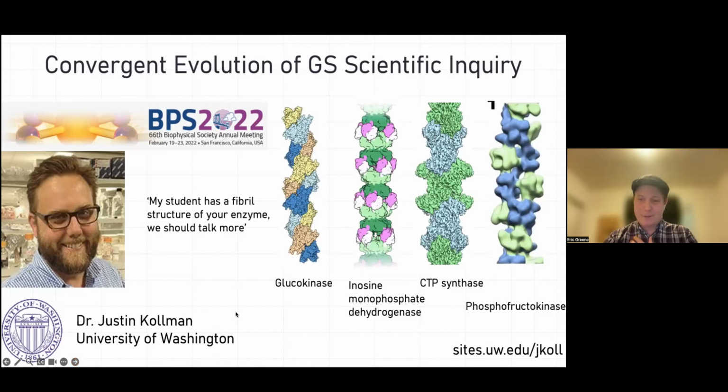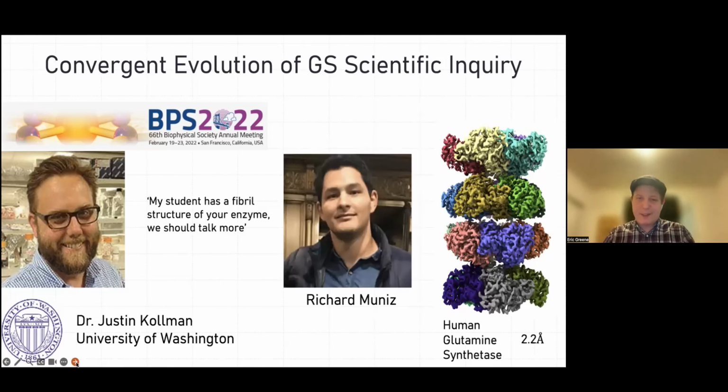The Coleman lab has solved just a ton of different cryo-EM structures of enzymes and is really at the forefront of this field. This is just a small subset of some of their recent studies. But luckily, we wanted to collaborate with each other. And so now I've been working with this very talented grad student, Richard, who provided an apo form glutamine synthetase filament structure, also at about 2 angstroms. And so we've been working with that to look at what some of the conformational differences are upon filamentation and what this is actually doing.